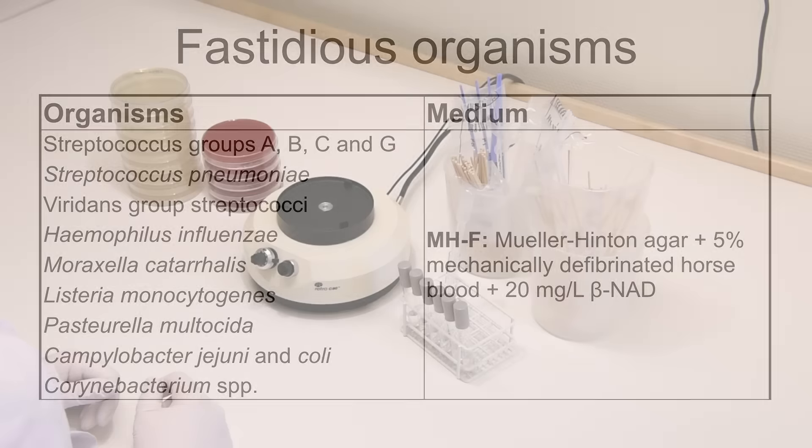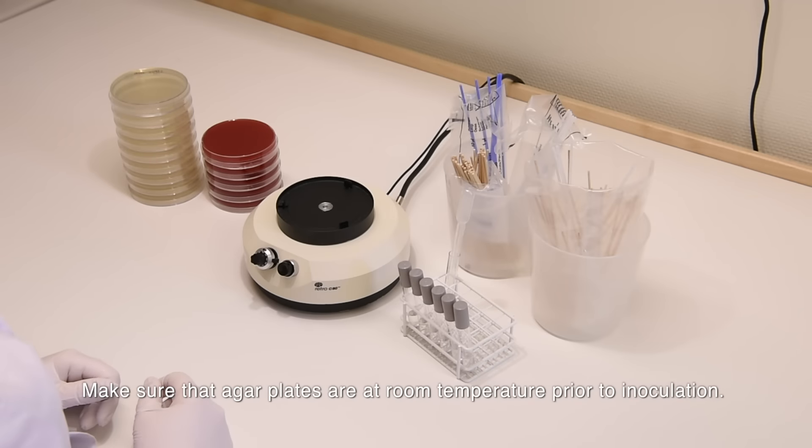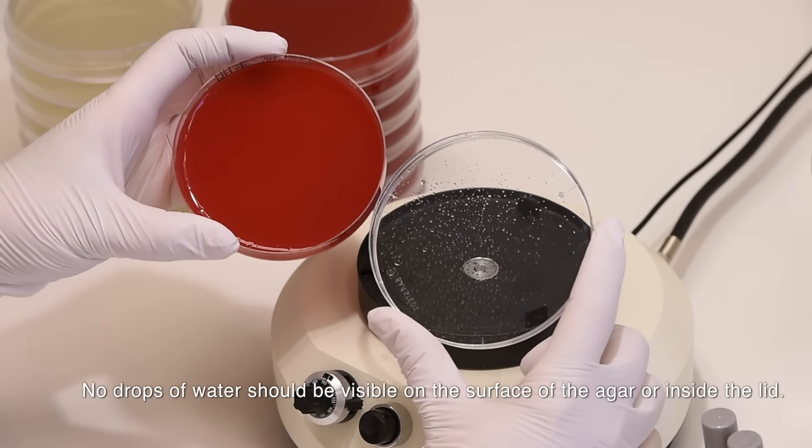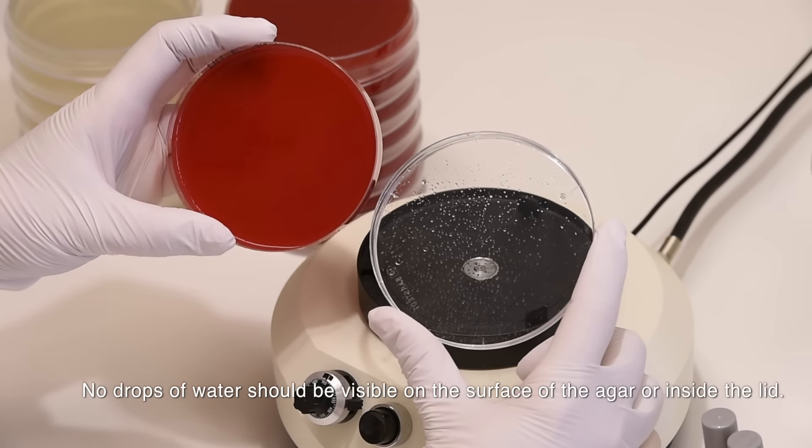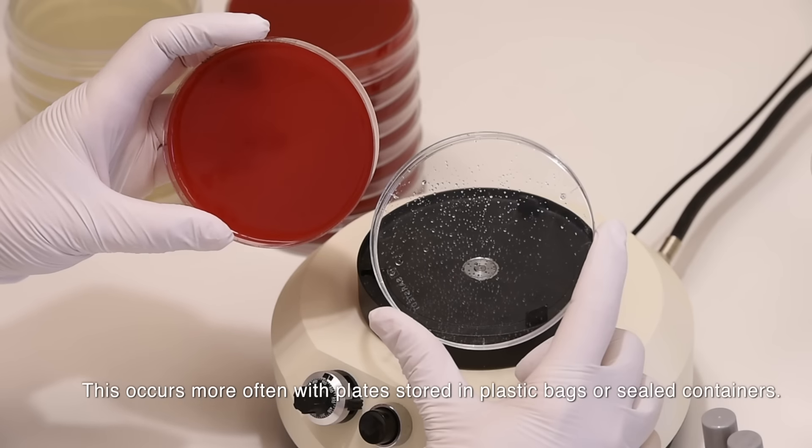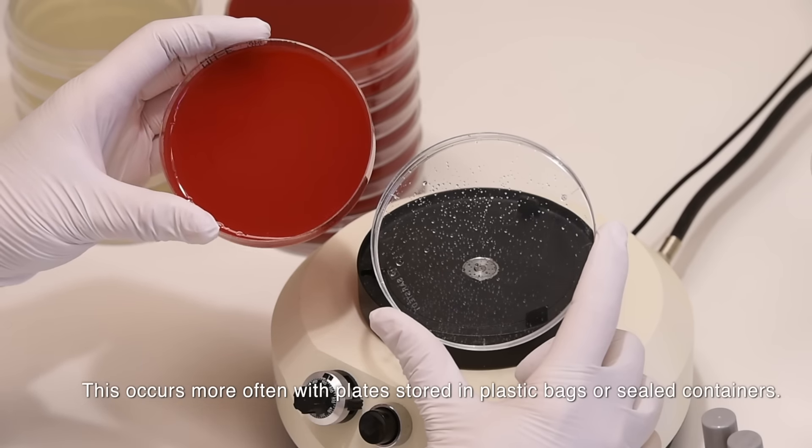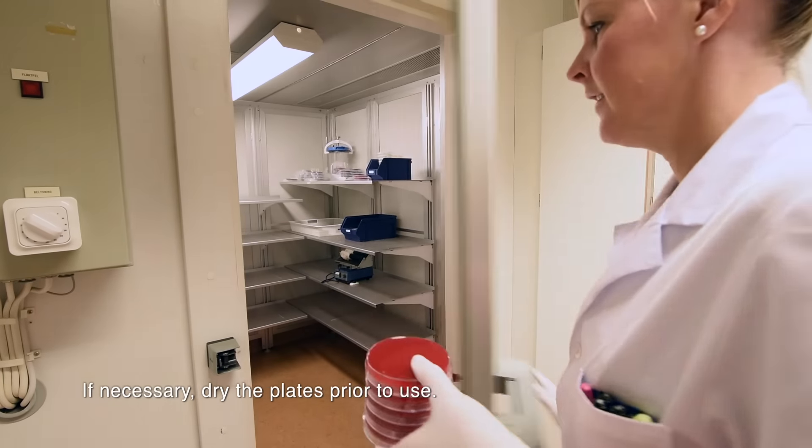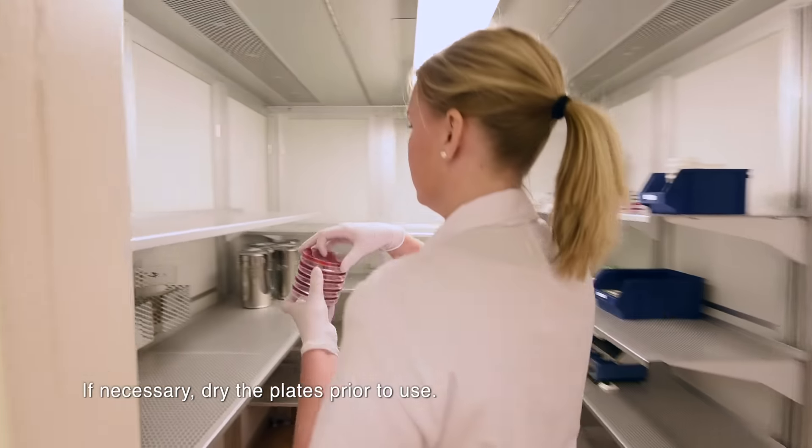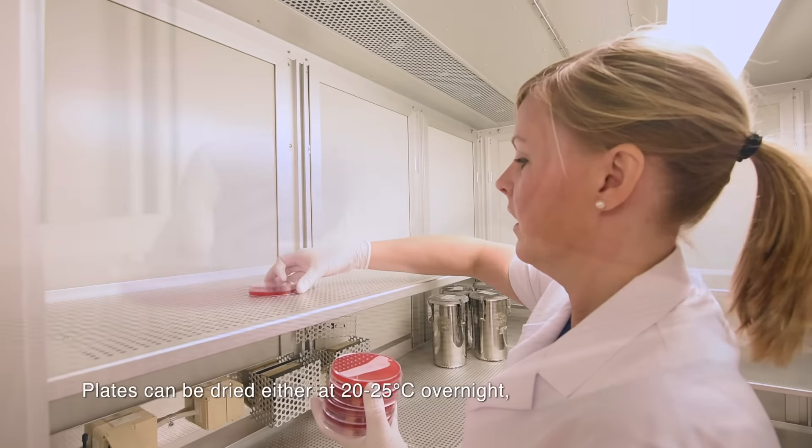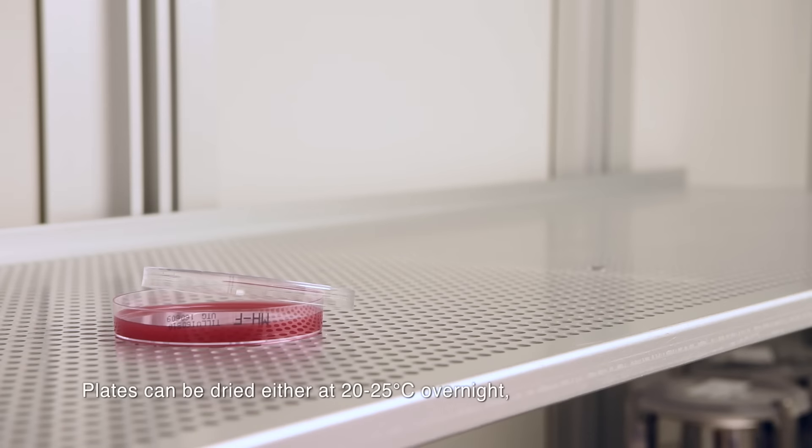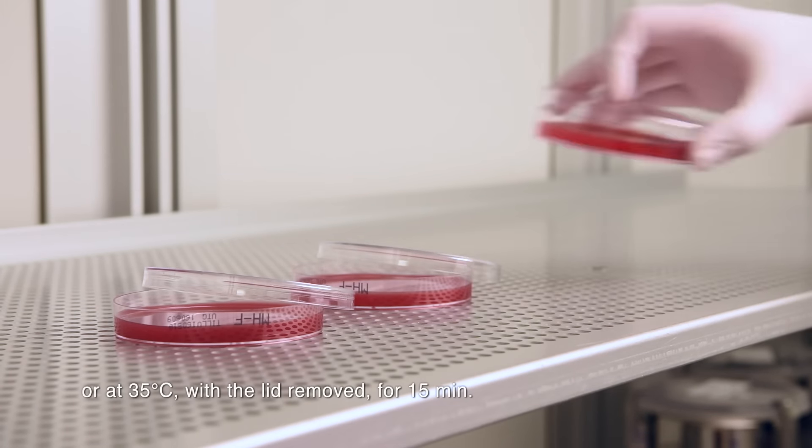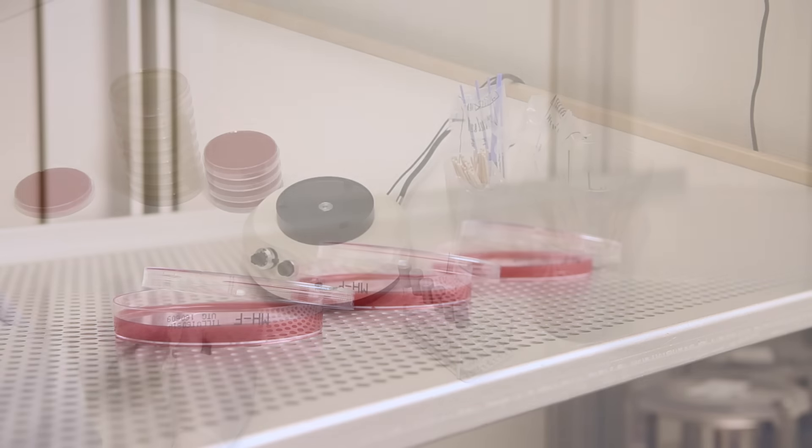Make sure that agar plates are at room temperature prior to inoculation. No drops of water should be visible on the surface of the agar or inside the lid. This occurs more often with plates stored in plastic bags or sealed containers. If necessary, dry the plates prior to use. Plates can be dried either at room temperature (20-25°C) overnight or at 35°C with the lid removed for 15 minutes.